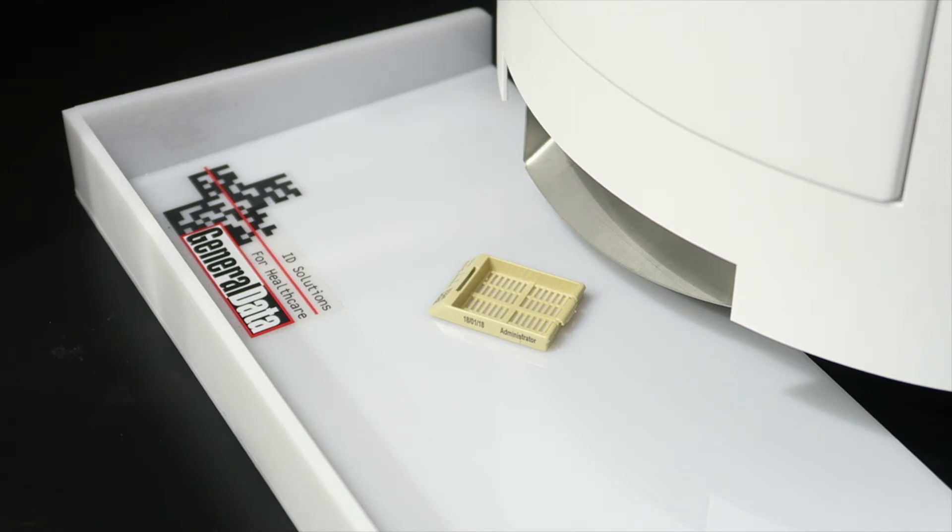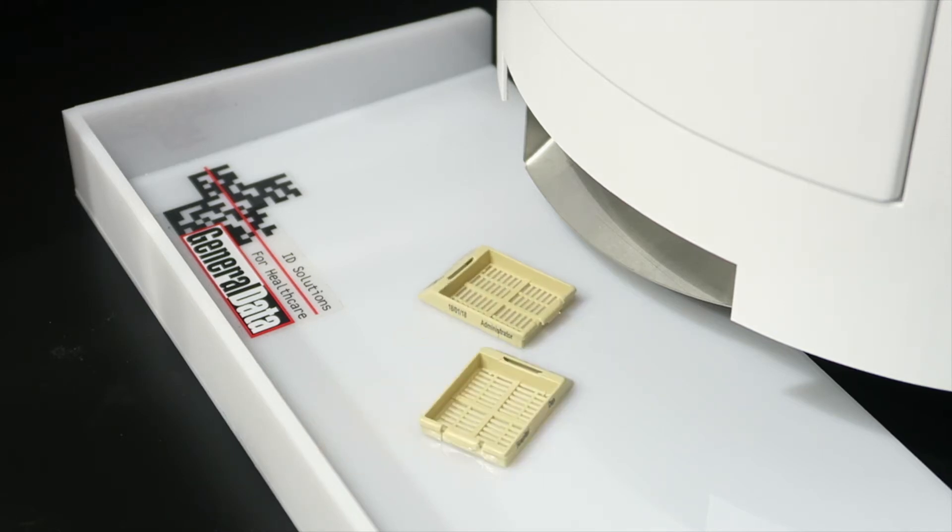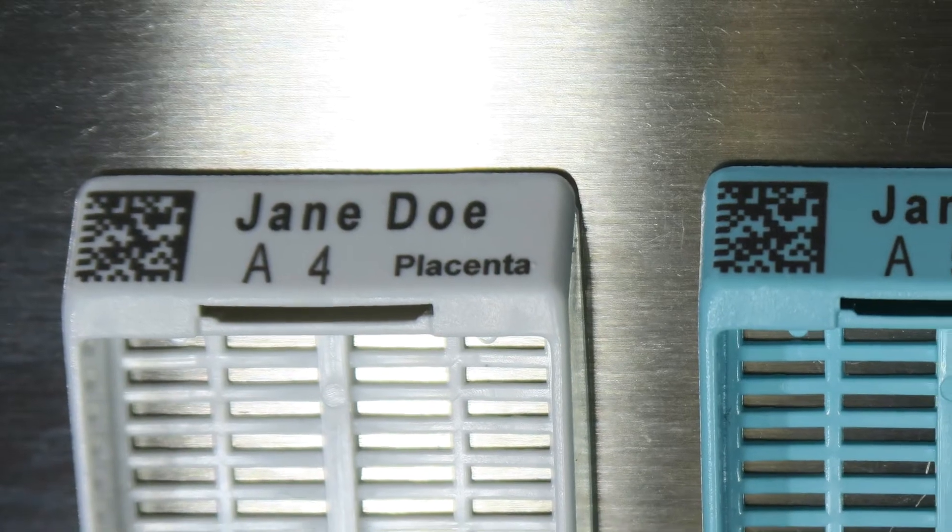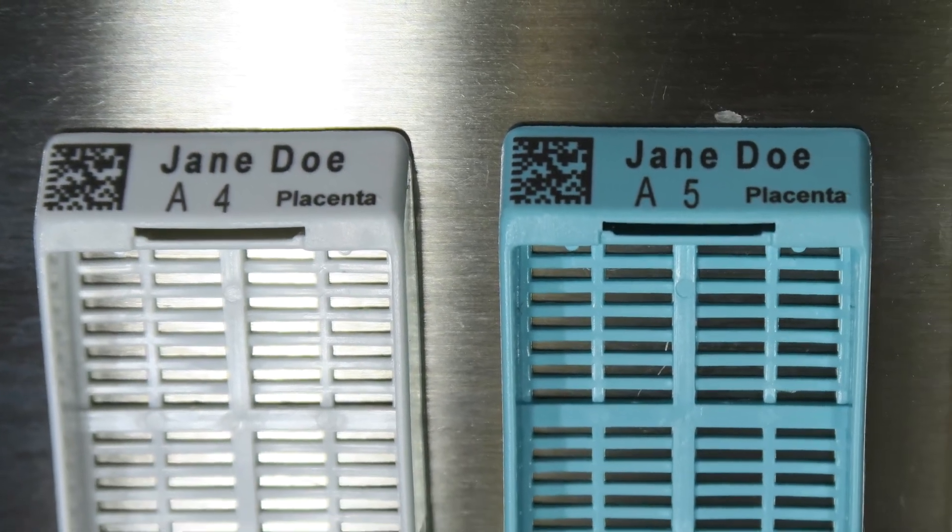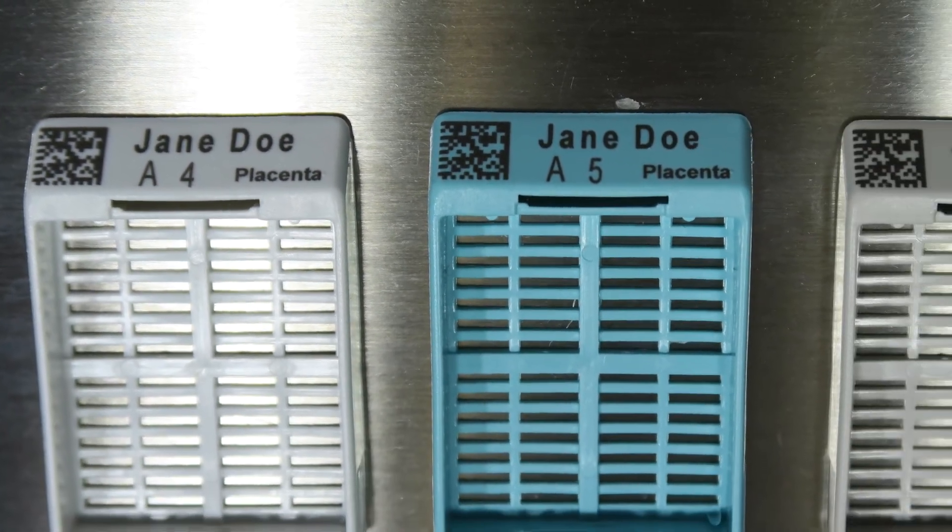Cassettes printed using the LaserTrack PH-8 are reported to have a 99.5% scan rate throughout the tracking process.